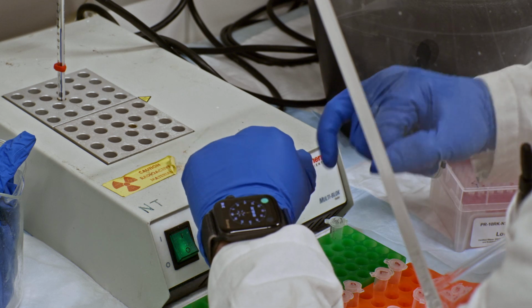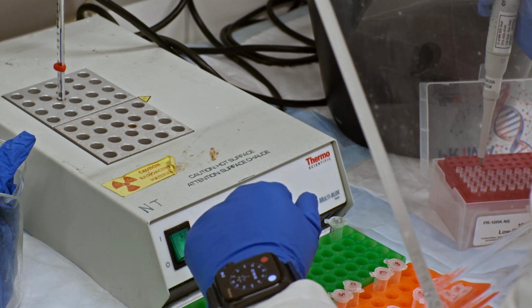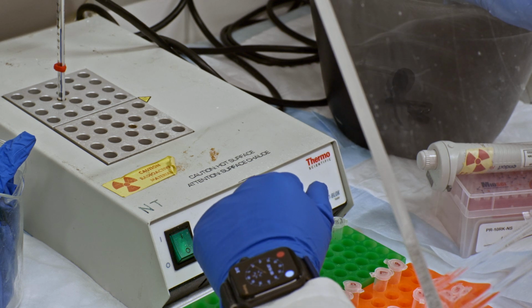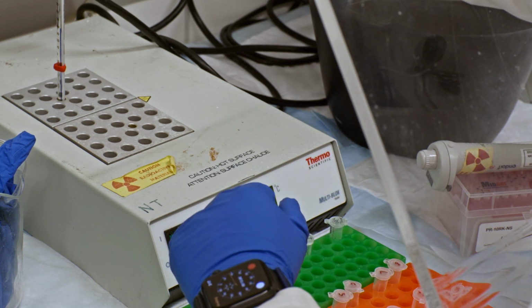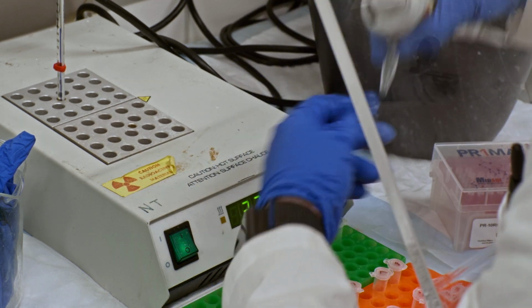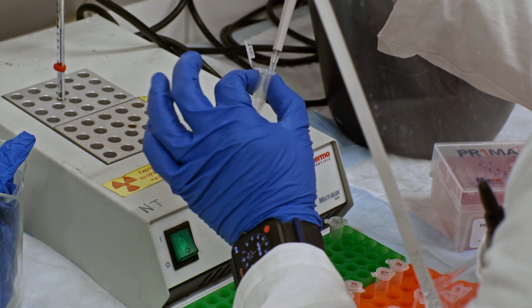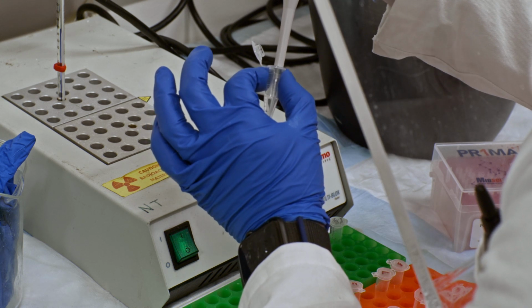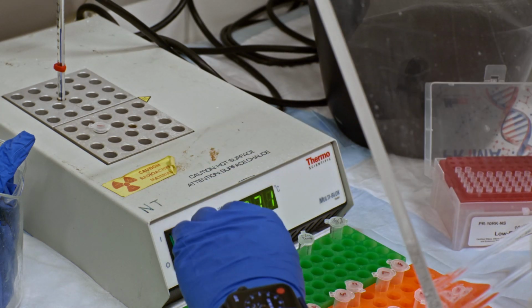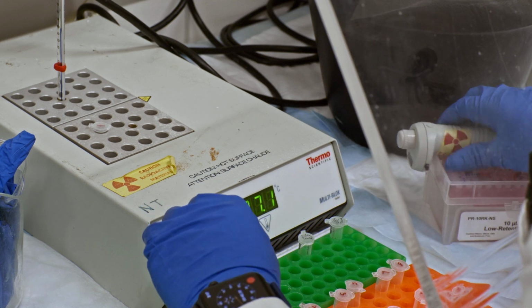So now let's get this experiment started. So like I said, I like to use a stopwatch on my wrist. So here we go. All right. I usually like to wait about 15 to 20 seconds prior to adding the dNTP or taking an aliquot from the reaction vessel. So dNTPs, I got it. Reaction vessel, I open it. I position my tip right above it, and now we hit 30 seconds. Mix it. It goes on the heating block. And then it's just rinse and repeat.